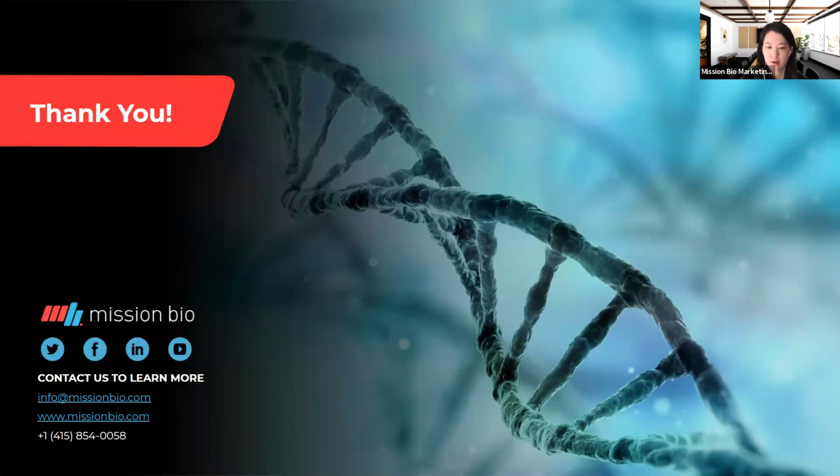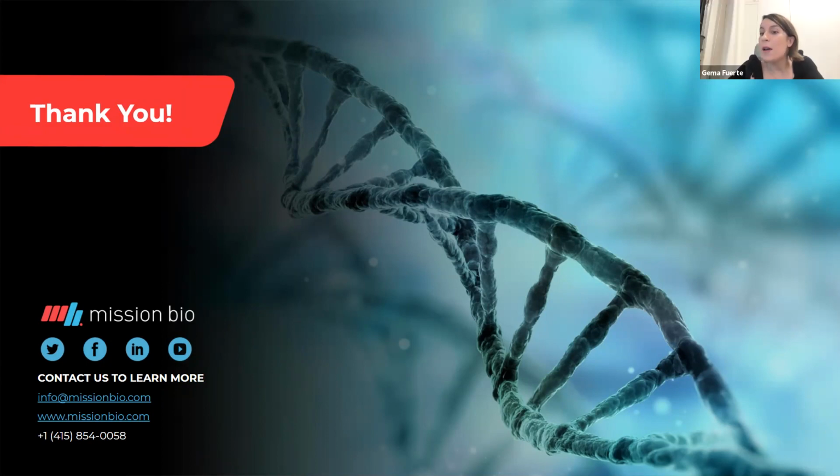This is an interesting question. Do you provide bioinformatics support for these analysis tools? For people who don't have a lot of bioinformatic resource, where do they start? Yeah, sure. I mean, we provide training for all of our customers. So we will have a session similar to the one we had today, where we take them through the software. And there are a lot of documents available on the website, as well as videos and follow-up sessions to help people familiarize with the software, regardless of their bioinformatics skills.